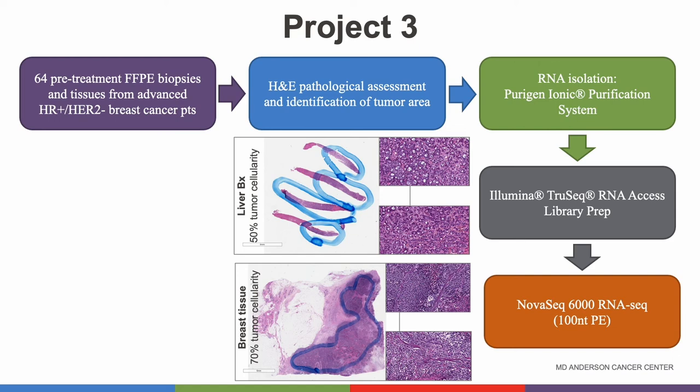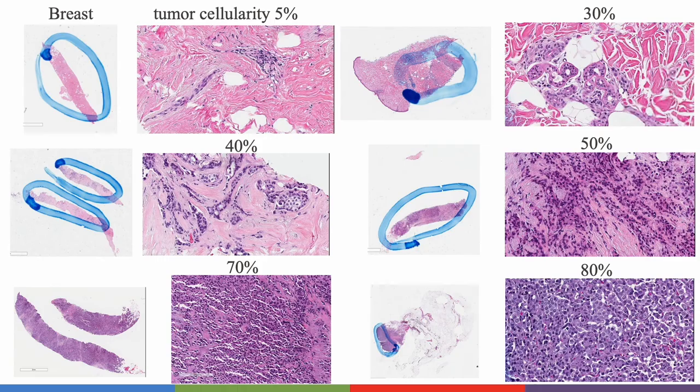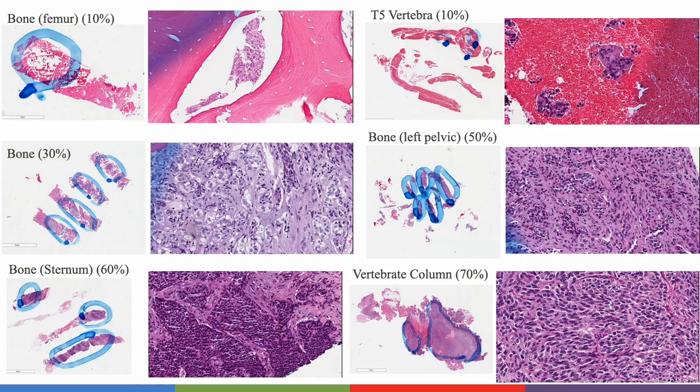This is the process. These are just examples of these tissues. About 40% are primary breast tumor tissue, and you can see the tumor cellularity ranges from 5% to 80%. You can see the tumor portion from small to large, and some of the tissue is very small. Basically, it's very heterogeneous. And these are the bone tissues, about 40% of advanced breast cancer metastasis to the bone. Again, you can see the heterogeneity of the tissue, with tumor portion from 10% to 70%.